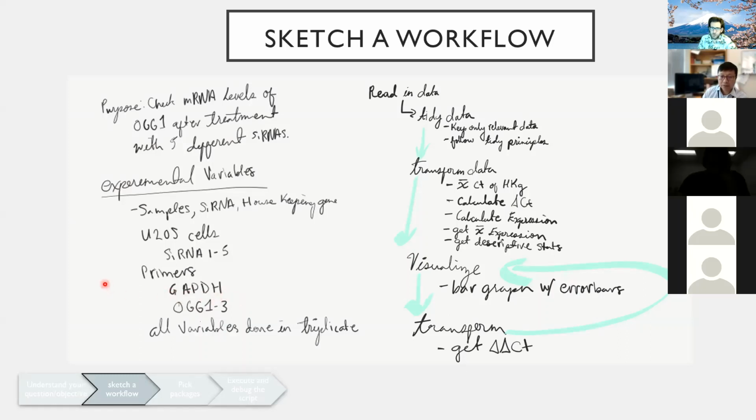So I suspect several of you have probably done RT-qPCR before. You'll probably recognize this sort of design. It's pretty standard and straightforward for analyzing expression of RNA. But for those of you who aren't familiar, do feel free to ask if you have any questions. Do feel free to ask for more clarification, and I'd be happy to stop and give a little bit more clarification on this.